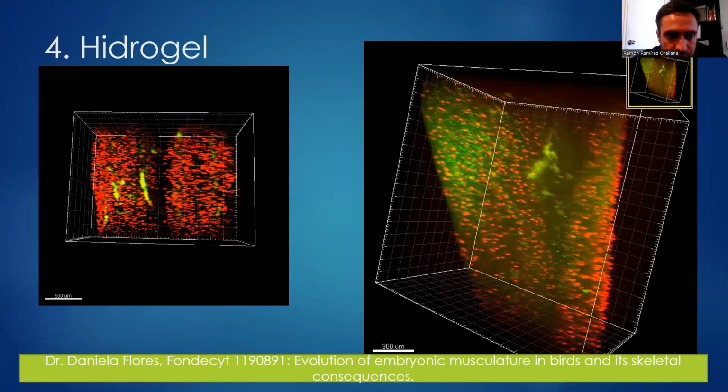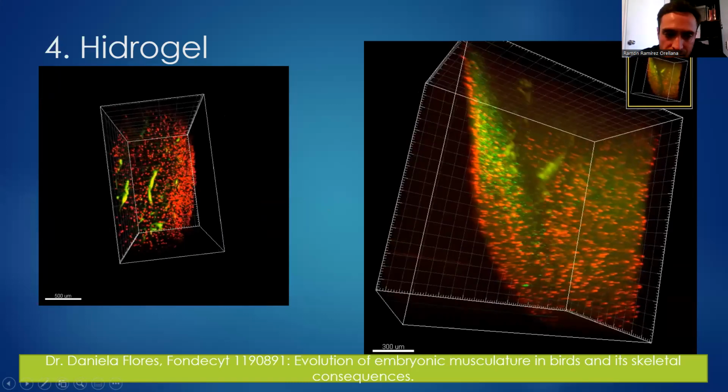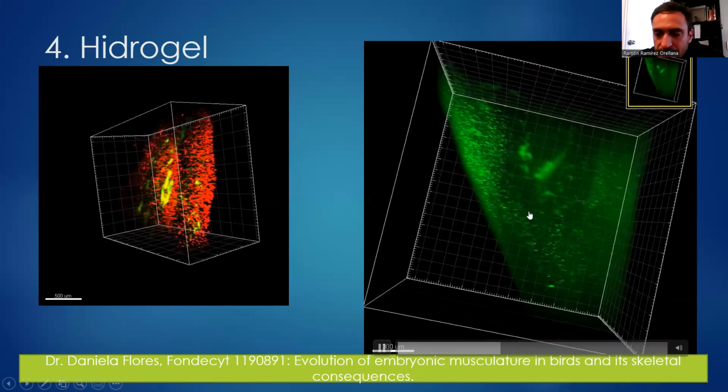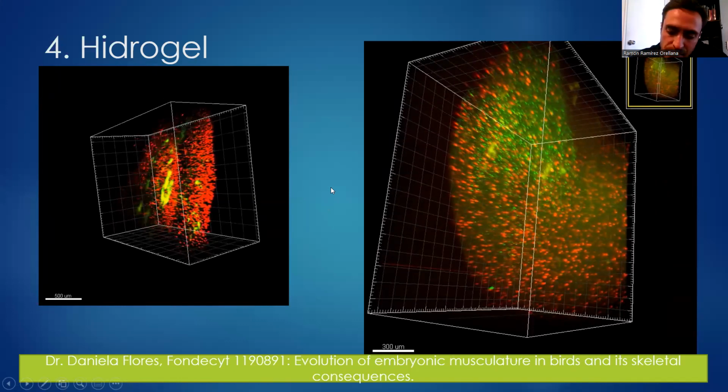Estas son fotografías de otro equipo de investigación que vino a nuestro microscopio, al Lightsheet, y obtuvo esta fotografía, ¿ya? Y ellos también tenían el mismo problema que nosotros de la penetrabilidad de los anticuerpos. Y ahí estamos comentando qué es lo que podemos hacer, y ojalá que después de esta charla, si alguien tiene mayor experiencia en este tipo de técnicas, podamos comentar qué es lo que se puede hacer para lograr tener mayor penetrabilidad del anticuerpo, como les comentaba.